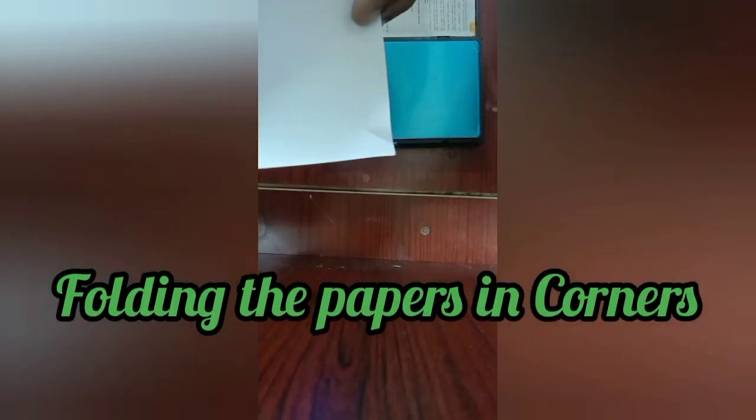Once cornering the paper, keeping it in the center, the paper weight will display. Then you want to tare it. Here is the tare button, you can tare the paper weight. Now it will show the 0.